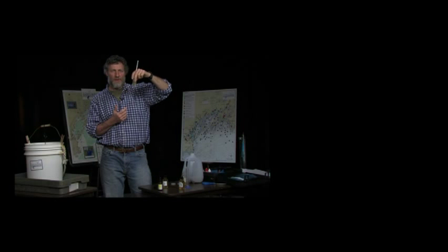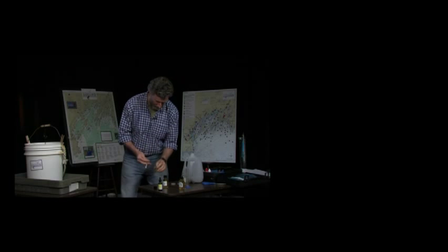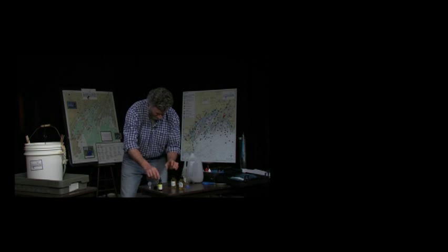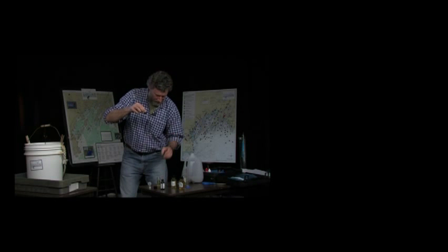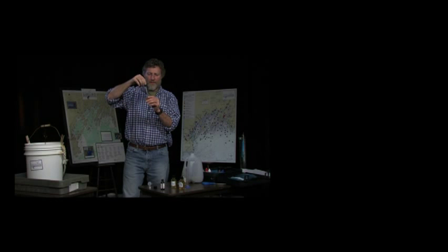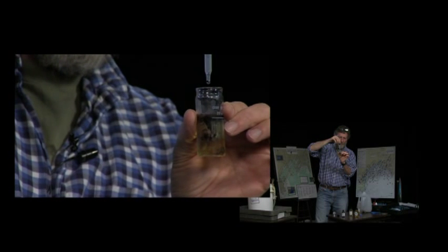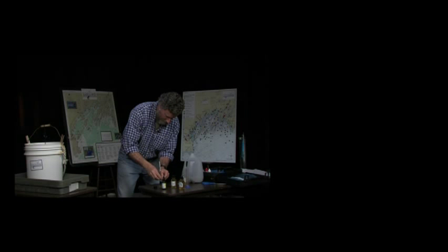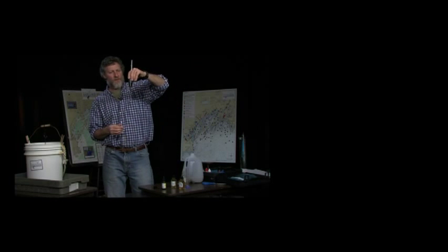But eventually, if I were to continue doing this, it would be so clear I wouldn't know when the end result is. So what we're going to do is add another chemical to it, which is called a starch indicator. You can take the cap off. You can leave the syringe in the cap, set it aside. And we'll take some of this starch indicator. Again, this is like all the other chemicals in the kit. It requires 8 drops. So we'll go. And it starts to form a bit of a purplish color to it. Snap the cap back on, and we'll swirl it up.